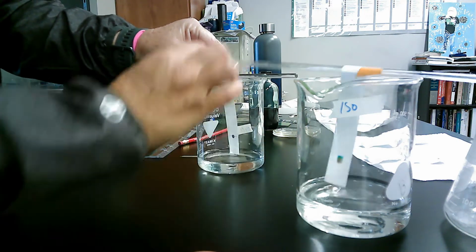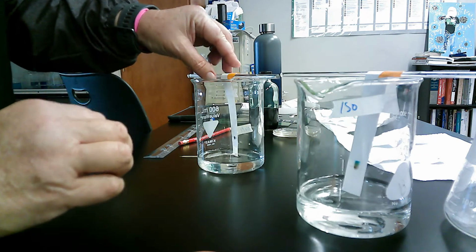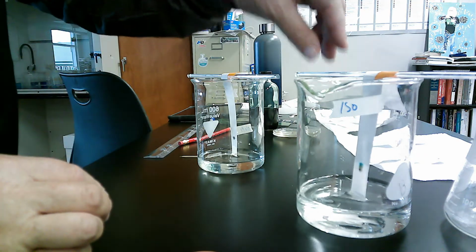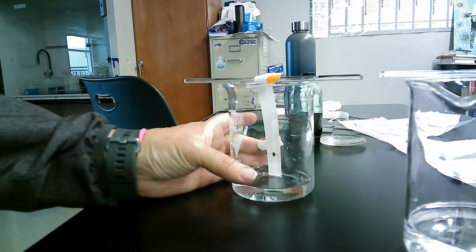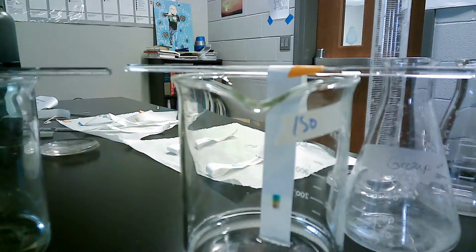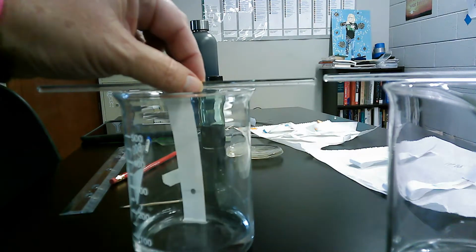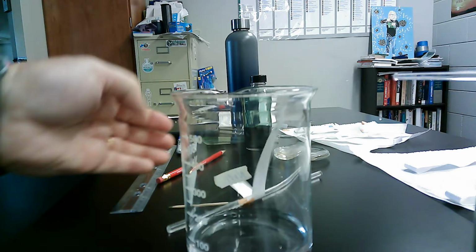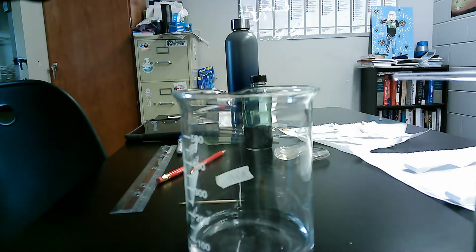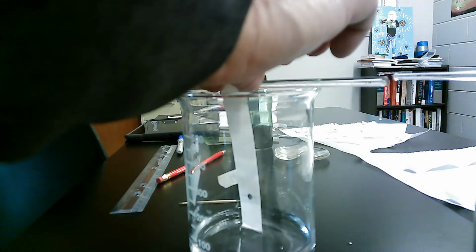So I'm going to turn it so you can see it a little bit better. I knocked the other one. I can see this one is there also. You can already see that this one is starting to separate. I have this one that's now climbing up. You can't really see it very well, but I can see where the solvent is actually already climbing up. Whoops, knocked that out. And put it right back in very carefully.